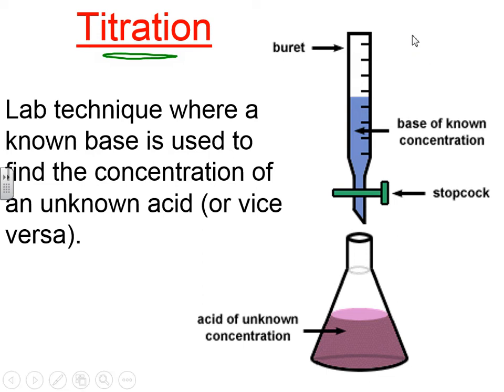as you'll see. So this is a lab technique used to find the concentration of an unknown, say an acid, from a known, say a base. And you can reverse it.